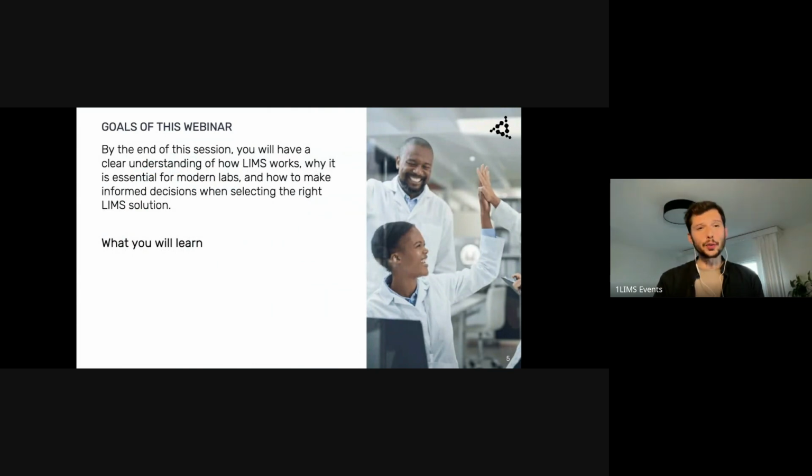What are the goals for today's webinar? By the end of this session, the goal is to clearly understand how a LIMS works and why it is essential for modern laboratories in quality control and quality assurance. Also, the goal is to make an informed decision on why and how to select the right LIMS solution.